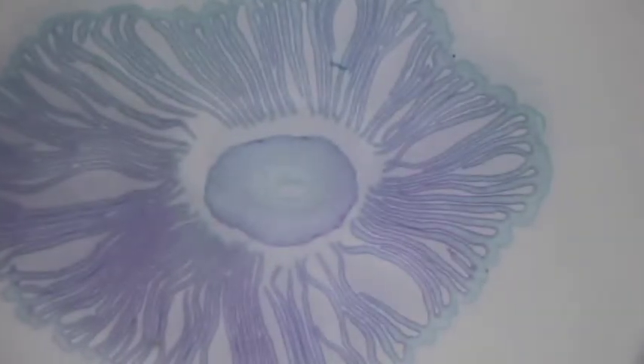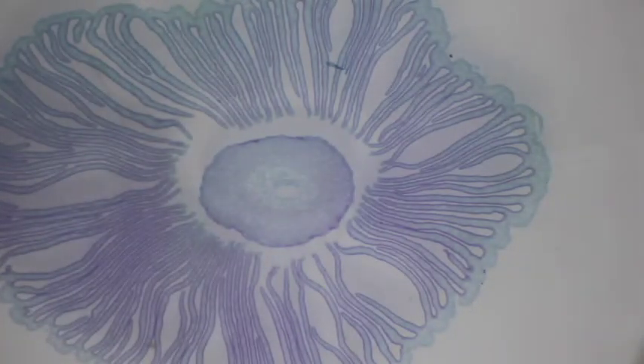If we look at this we can see that it is a gilled mushroom. See all those striations and things — those would be the gills, running through those gills. Easy to see that that's a gilled mushroom.